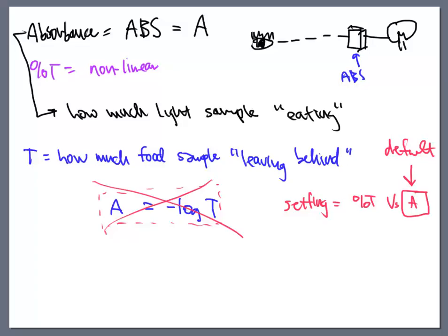That value by default is the absorbance value. It's looking at how much food is on the plate of that molecule. How much of it is it eating? That is the magic number that we need to measure and do our data analysis with.